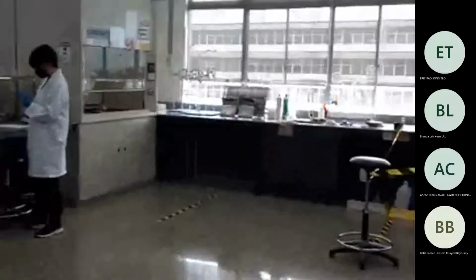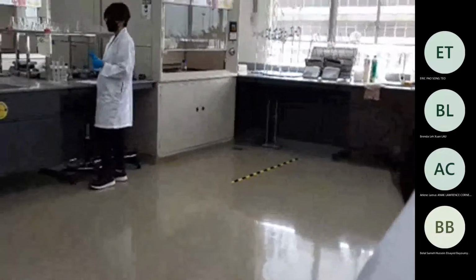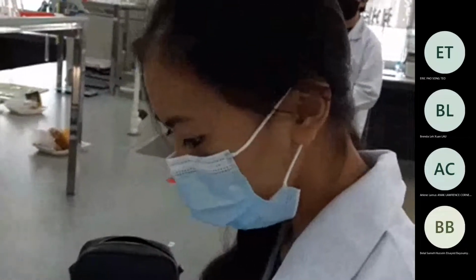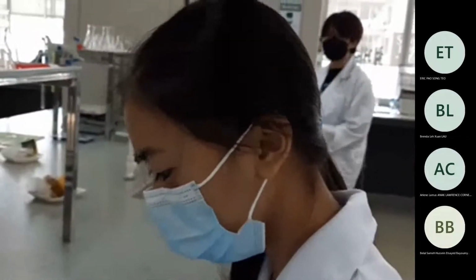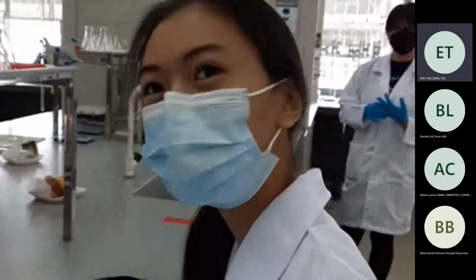Lynn says that she does not think that they mix together because of what, Lynn? They are measured for the pH. Okay, for the pH only. Noor, what was the mistake I was making? Ethanoic acid and hydrochloric acid react 1:1. Is that true? No, we are doing it separately, like HCl first and then ethanoic acid.